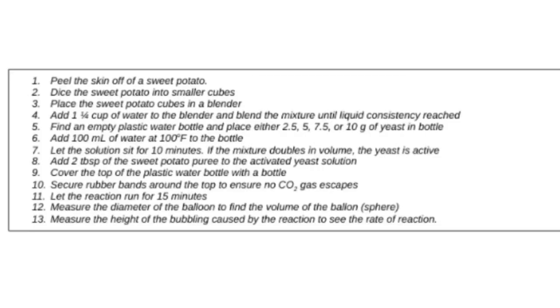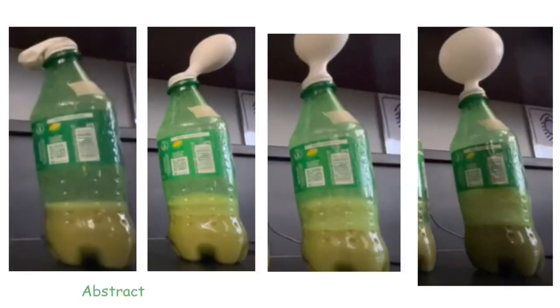So here are some images of procedures, materials, action plans, and visual setups that help us succeed in this experiment. The purpose of this experiment is to test how certain external factors, in our case, concentration of yeast, affect the enzyme activity rate of amylase.